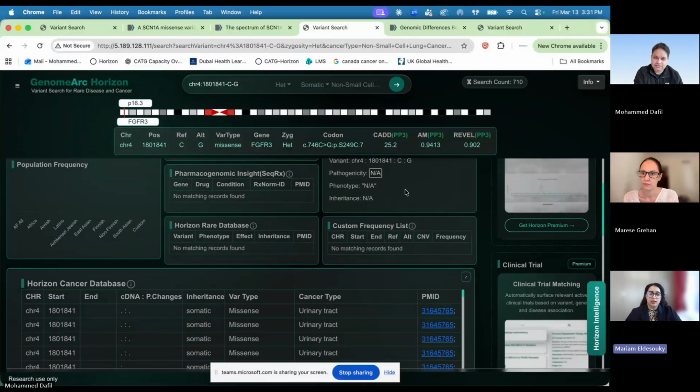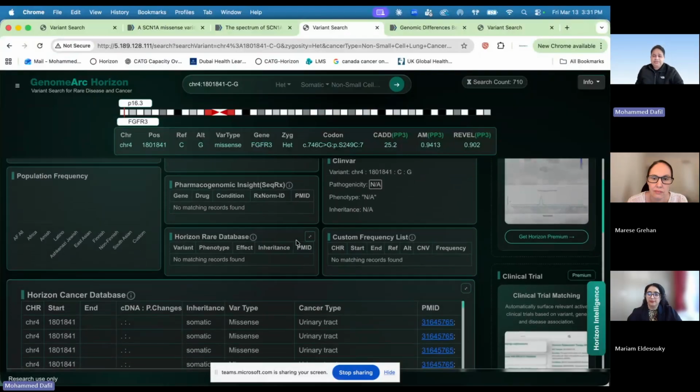Yes, very nice. Now, zooming in a bit on the pharmacogenomics part, because I know a lot of people are interested in that. Can you tell us a bit more how it's curated? So pharmacogenetics curation is a multi-year effort. It's not just LLM-based curation, because you have to be very careful what kind of relationship you put out. The curation we did for rare disease is basically all the FDA-approved drugs and also the drugs that are being reported in different types of large cohort-based studies. And for those studies, we provide the PMID as well.